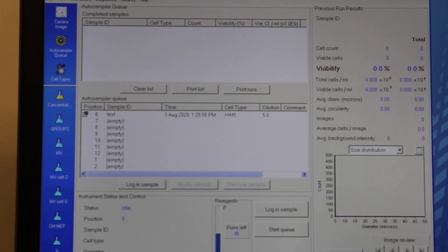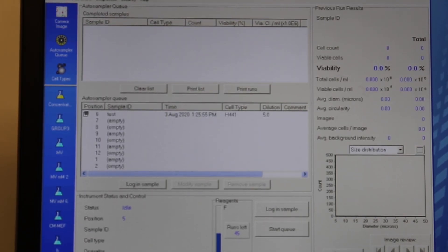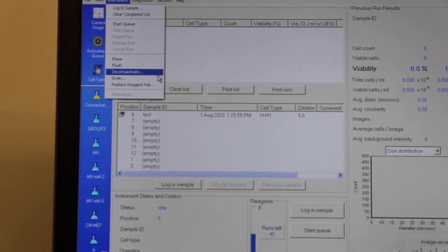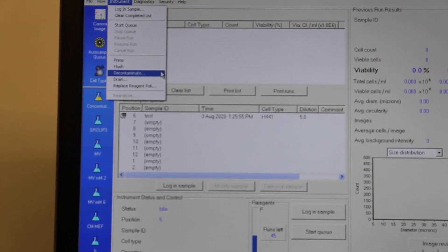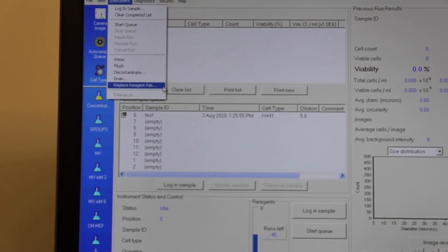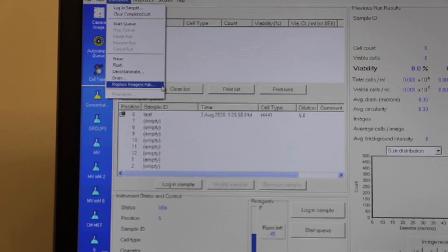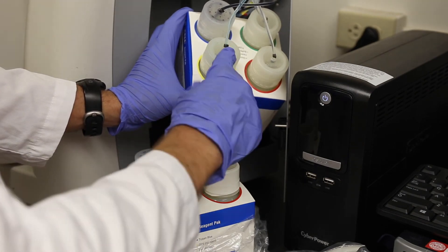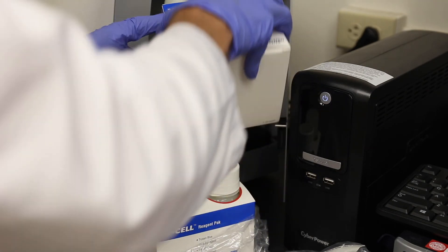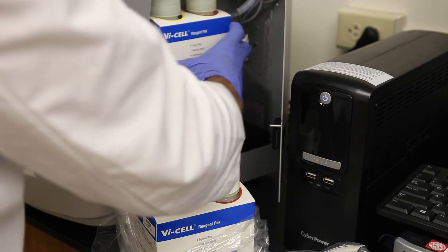At the bottom of the screen you will see the reagent count, which shows approximately how many runs you have left with the reagents. When it gets low you will be prompted to replace the reagent pack. Click on Instrument > Replace Reagent Pack and follow the on-screen instructions, which will walk you through removing the old reagent pack and placing the new one in the correct spot.